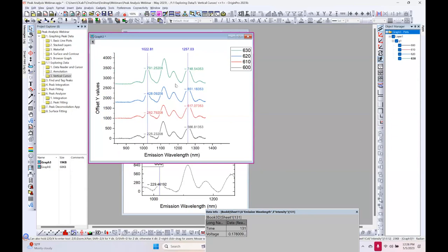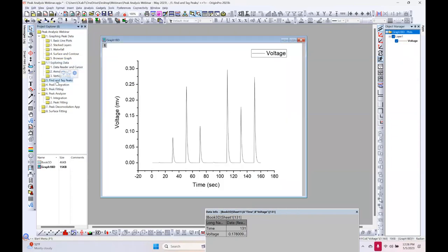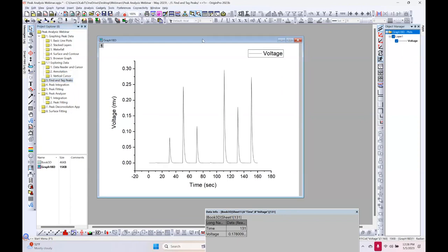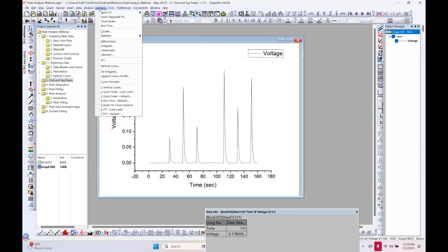So far we have seen various plot options for peak data and some tools for exploring data. Now let's move on to analyzing the data. First, I would like to just find all peaks in my dataset. With this graph active, rather than tagging one at a time, I want to find them all. Let's go to the gadgets menu — there is a gadget called quick peaks.